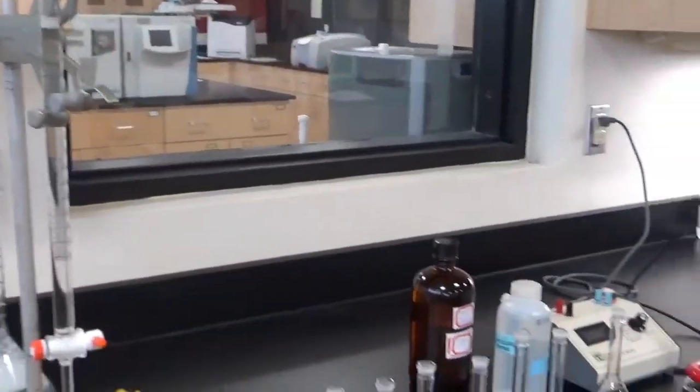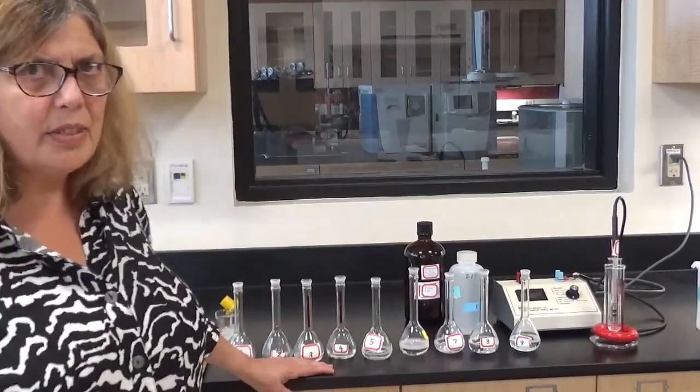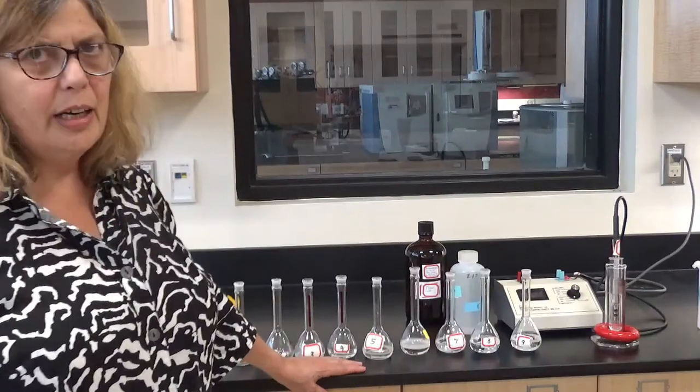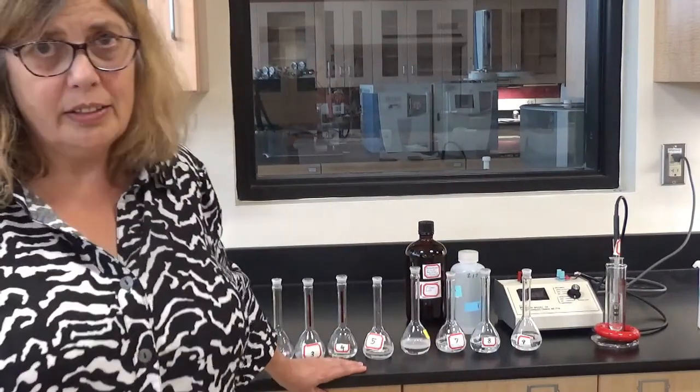All right, so now I've got all my flasks with the right amount of the CTAB solution in it, and I'm going to pipette 5 milliliters of phenanthridine into each one. So I'm going to go find a 5 milliliter pipette.